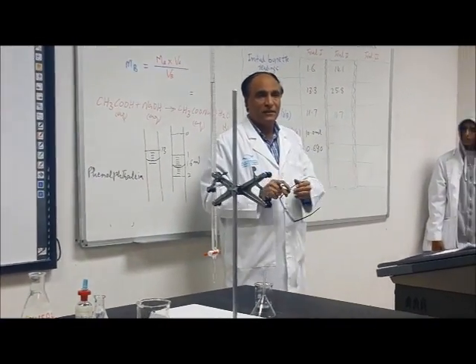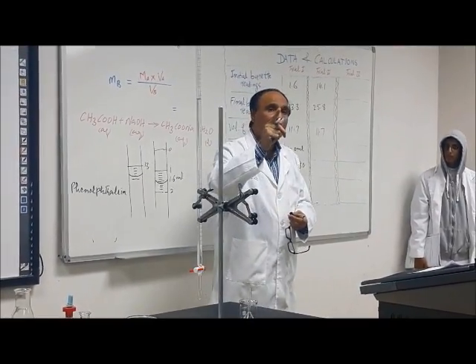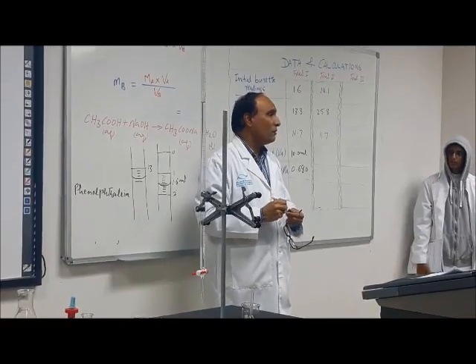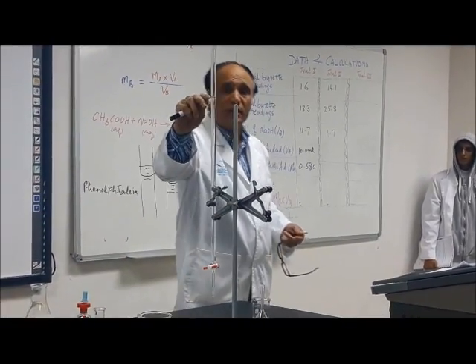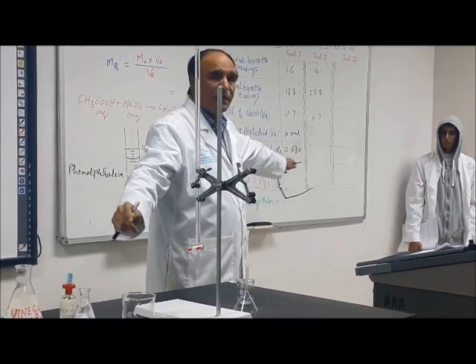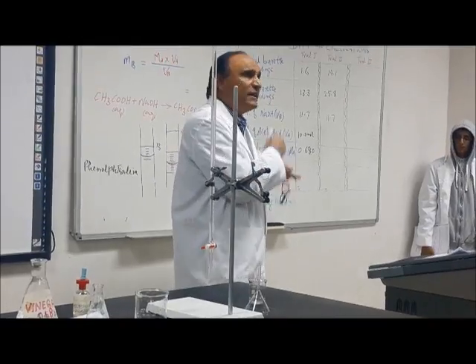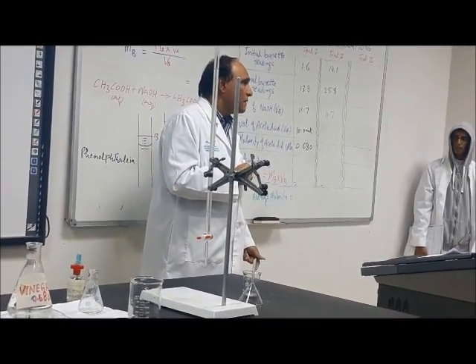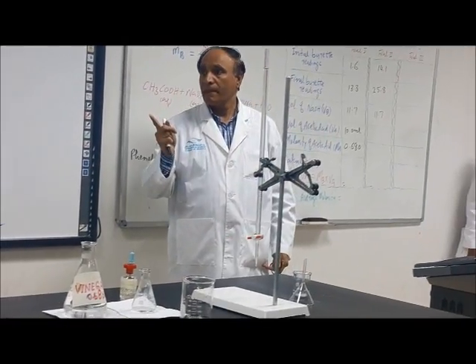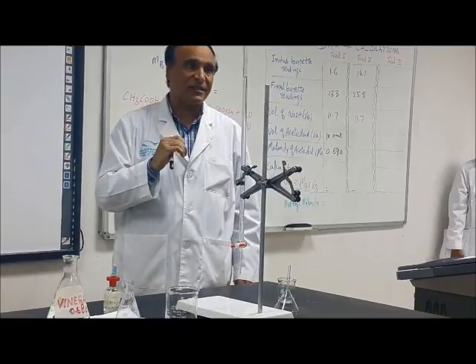What's the reason? See the difference between first time and second time. Do it fast. I am sure about the first one. You can do it fast. If I do everything without this, I can get the second. So why did I do this one? Do it fast, because you know the accuracy or not. To do it fast, yes. Correct. To do it fast.